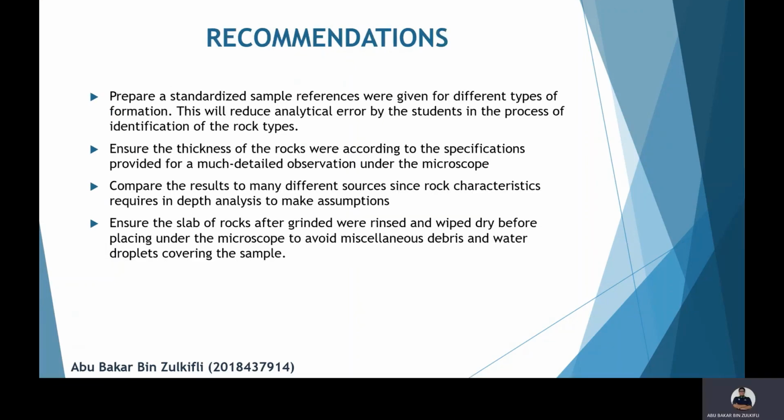Now I'm going to explain the recommendations for this lab. For the recommendation, first, we need to prepare standardized sample references, which are given for different types of formation. This standardized sample reference will reduce the analytical error by the students in the process of identification of the rock types. Next, we need to ensure that the thickness of the rocks is according to the specifications provided for much more detailed observation under the microscope.